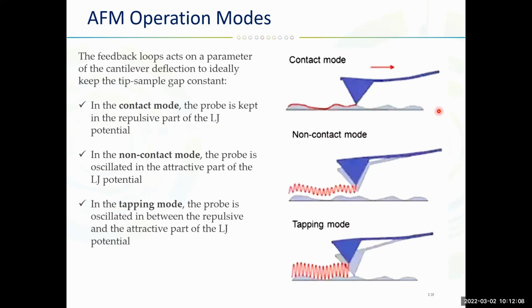There are some limitations of the contact mode. That's why non-contact and tapping modes were developed. But the good thing is that it is the fastest of all topographic modes, because the deflection of the cantilever directly shows the topography of the sample, and no summing of oscillation measurements is required. What kind of implications of contact mode AFM exist?